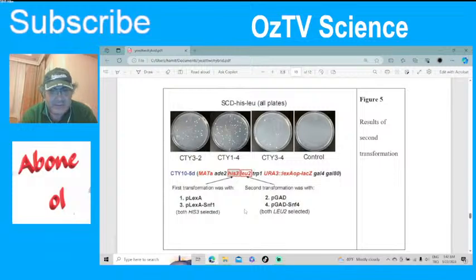In this plate we have this combination, plasmid 3 and plasmid 4. This combination should have the color, because it has plasmid number 3 and plasmid number 4.